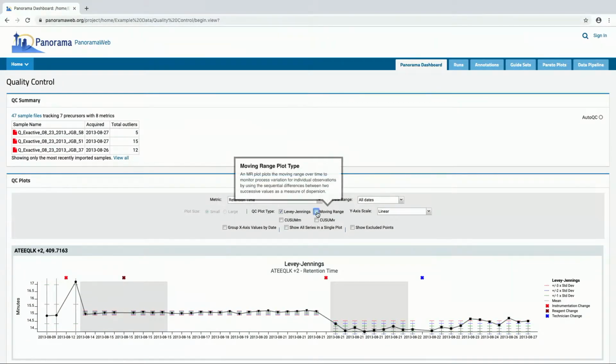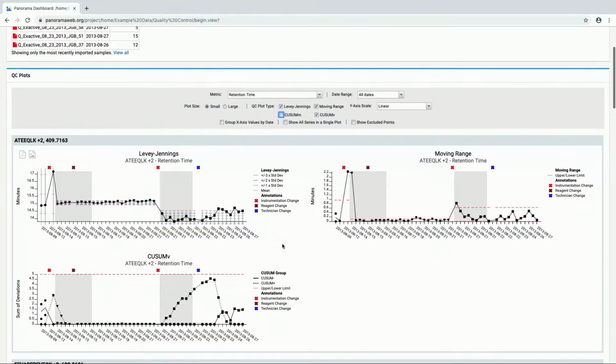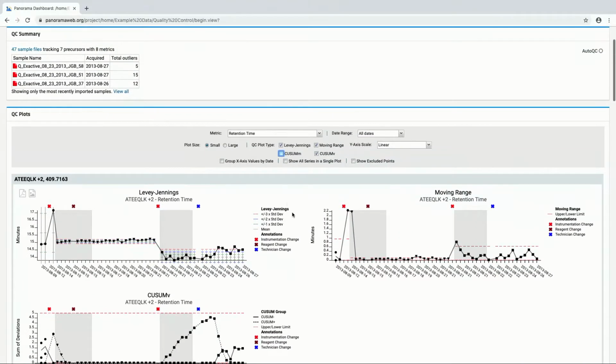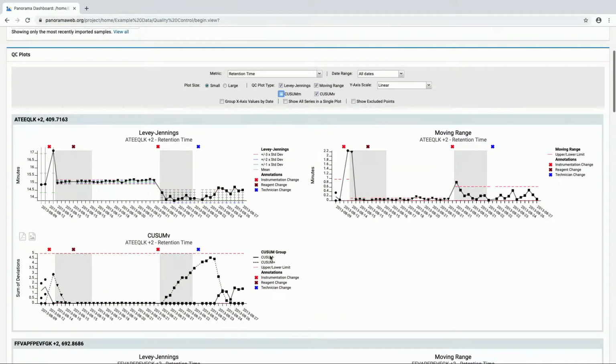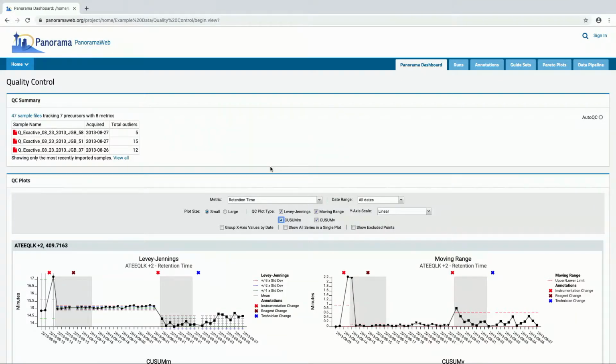So I can go ahead and turn on the other plot types if we want to be overwhelmed. The plots here on the projector, you can see, I won't go into the full detail of exactly what each one is tracking, but like I said, these give us insight into either increased variability, so maybe the mean is staying the same, but we've got a lot more bouncing around.